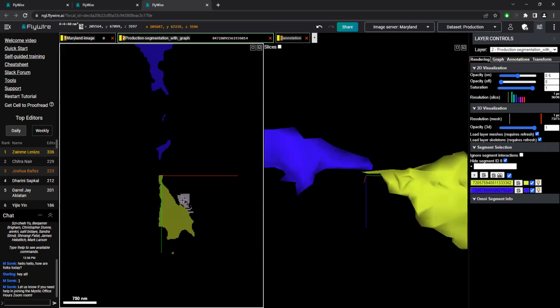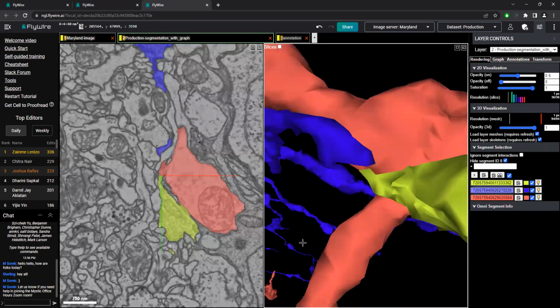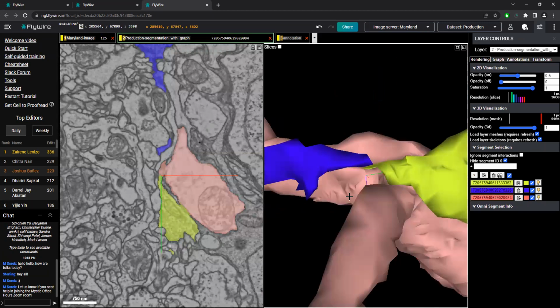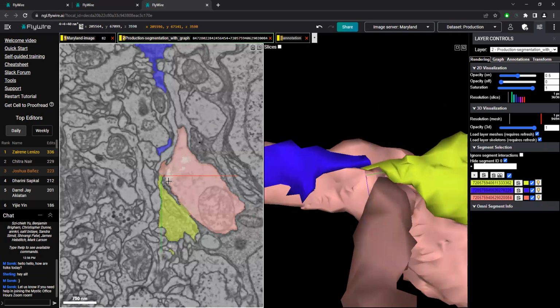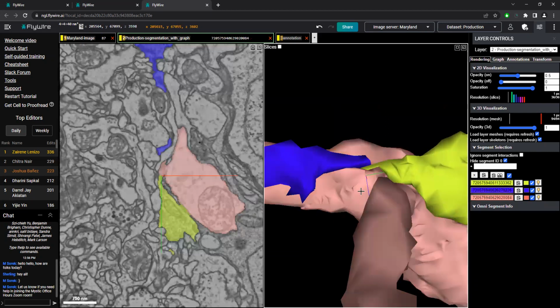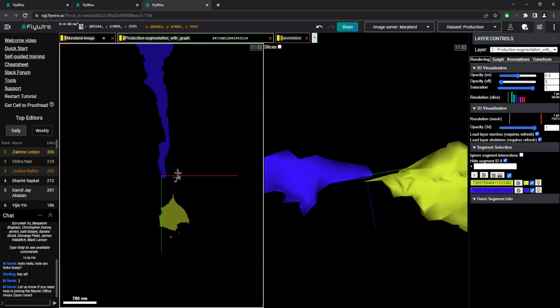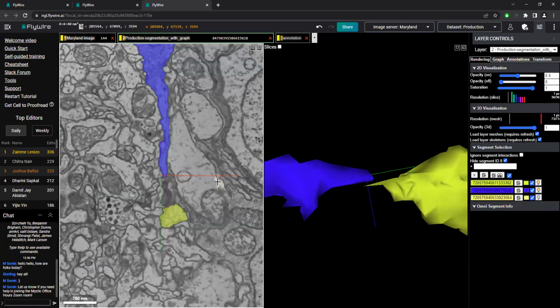The other thing we can do is let's bring that back, that red crescent shaped one. If we look at this in 3D and even in 2D, it fills in a little gap here. So maybe that is where it goes. And what we can do is try to see if we can find a back trace for the blue piece, just like we do in FlyWire.